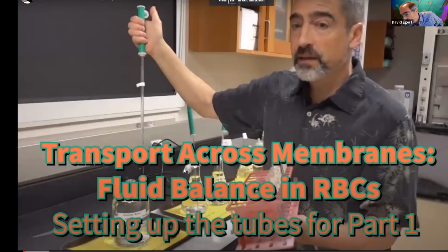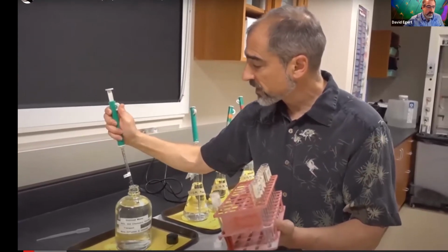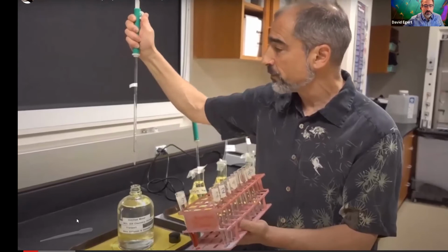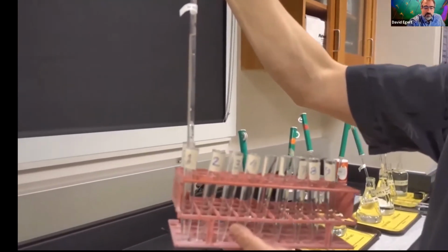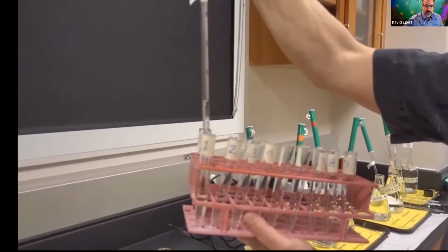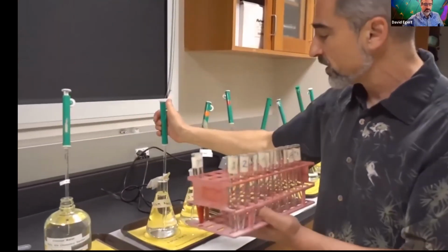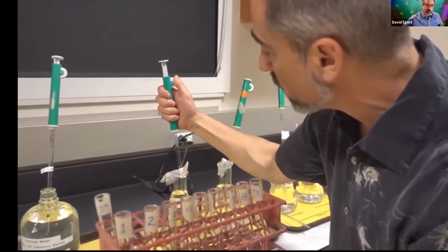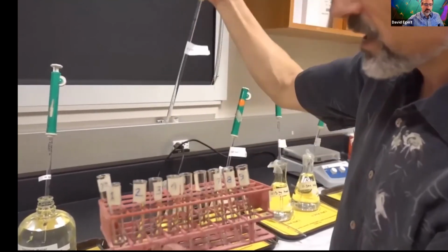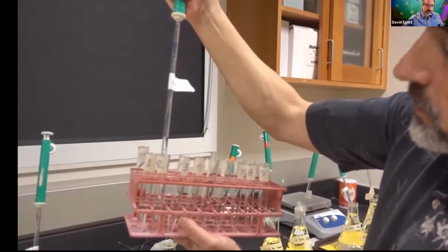All right, so I'm going to start with 3 mils of distilled water in test tube 1. Again, we've already discussed the proper use of these pipettes. I've sucked up to the 0 here, putting it in the appropriate test tube. Now I dispense down to the 1 mils dispensed, 2 mils dispensed, 3 mils dispensed, and that's that. I'm going to get 3 mils of my 0.05 molar NaCl. Again, just suck up to the 0 and put that in the appropriate test tube. Dispense 1, 2, 3 mils.